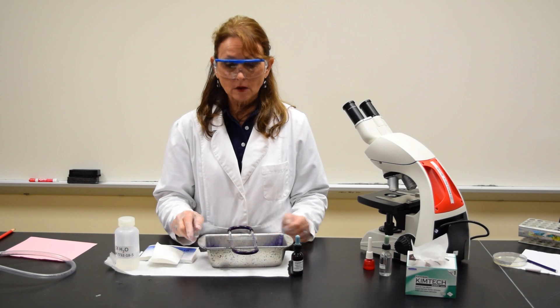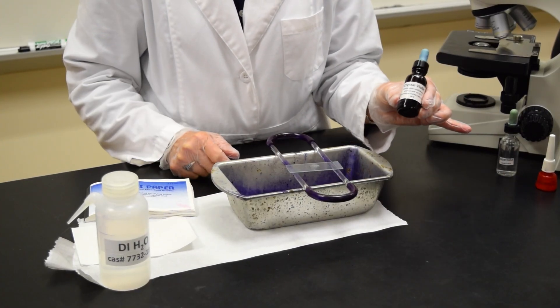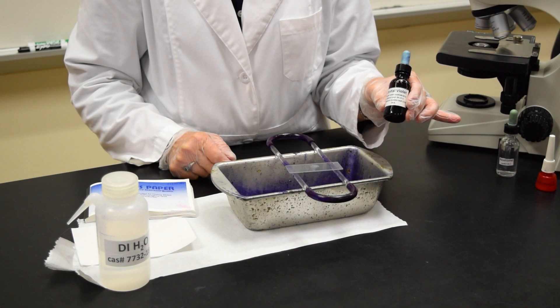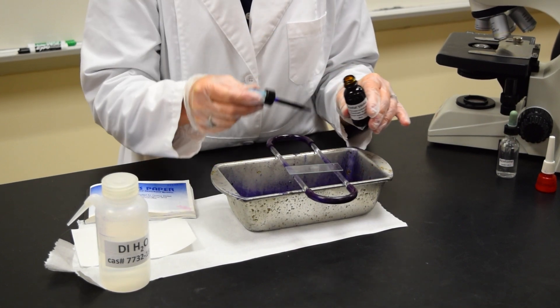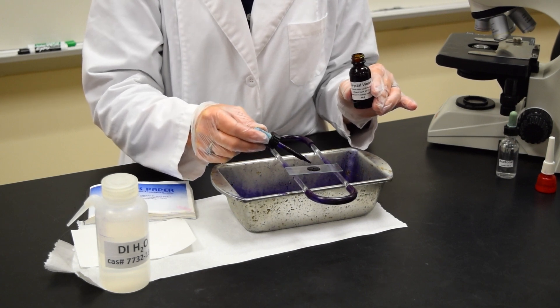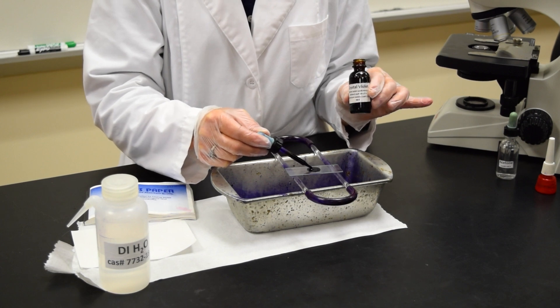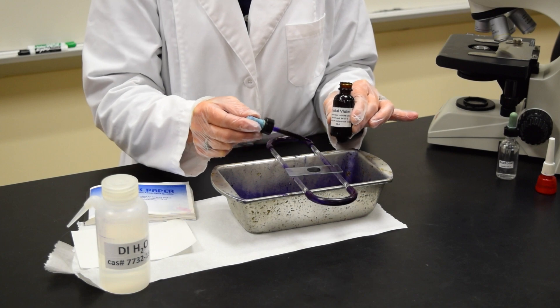Place the slide on the staining rack, which is over top of the tray. A simple stain requires only one reagent: crystal violet. Add several drops of the crystal violet onto the slide and make sure the smear is covered. It's okay that you touch the dropper to the slide because the bacteria have been killed when you heat fixed.